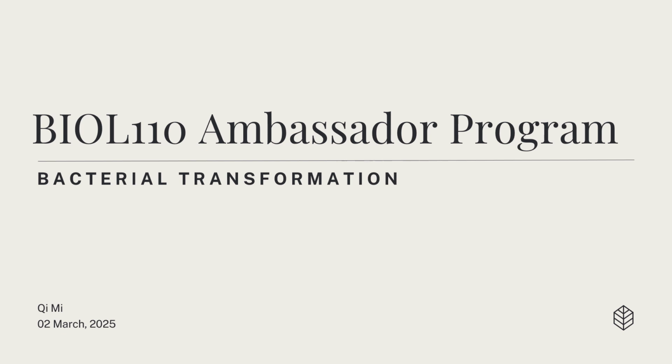I'm currently taking the BIOL110 class at DKU. So I will be presenting on the topic of bacterial transformation. This is a fundamental technique in molecular biology used to introduce foreign DNA into bacteria. And this is actually the context of the fifth lab in my course. This procedure allows us to study gene expression, protein production, and explore how bacteria adapt to new genetic materials.